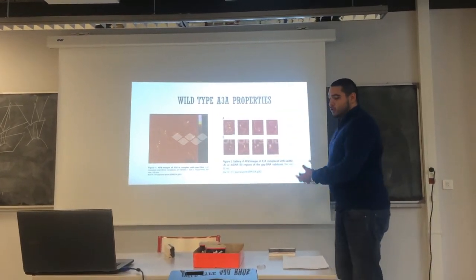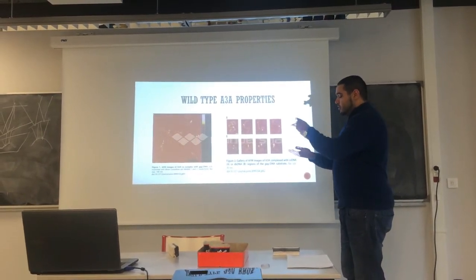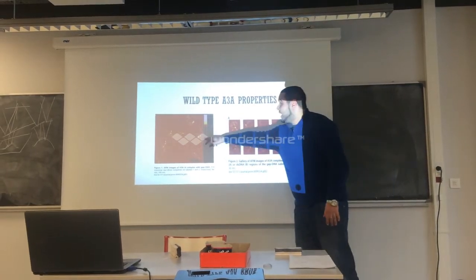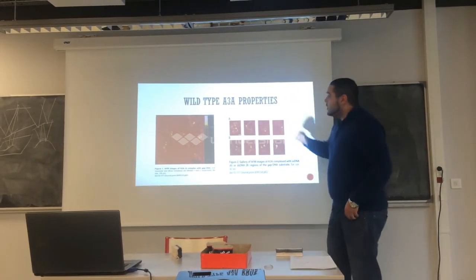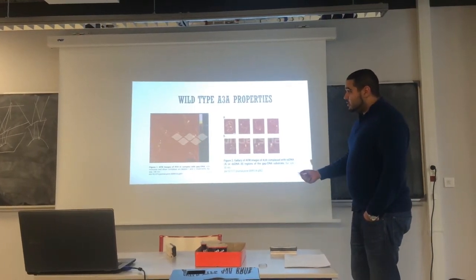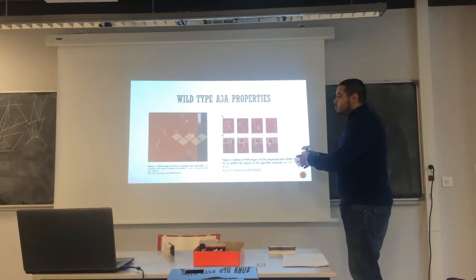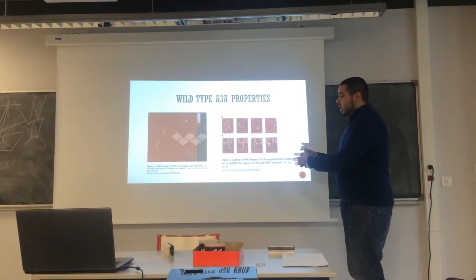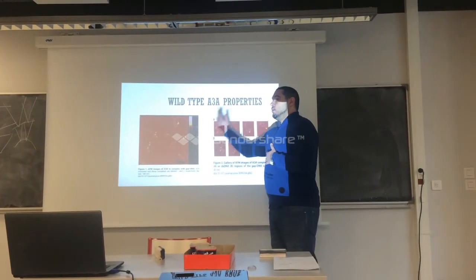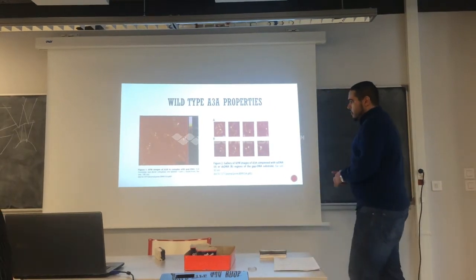Now, knowing that the DNA is going to be on the surface of the mica, if the protein links itself on top of it, it's going to be higher. And that is how they determine that these white blobs here, the higher points from the surface, are going to be the proteins. And I do say proteins and not protein because, again, they used FemtoScan to determine the volume of these protein complexes, to identify if the protein exists in a monomeric state, dimeric state, or just oligomeric state altogether.